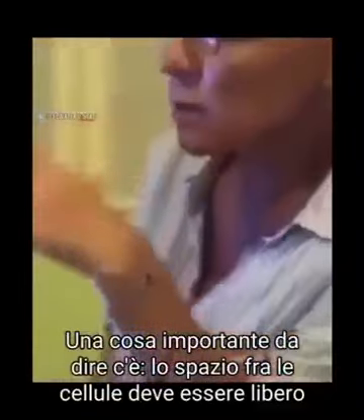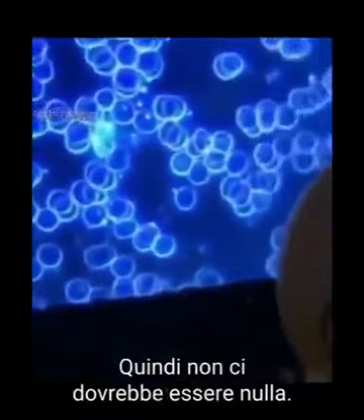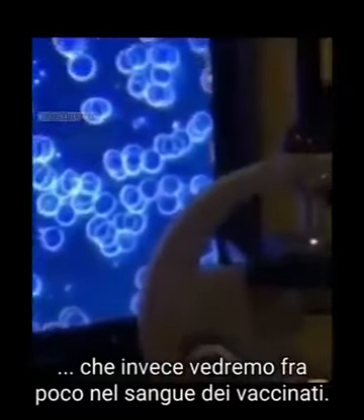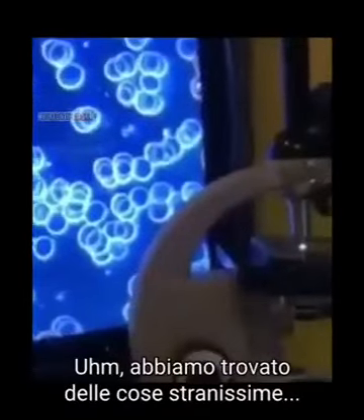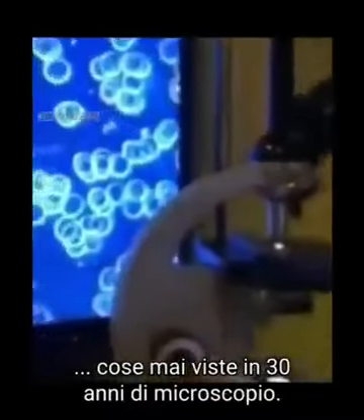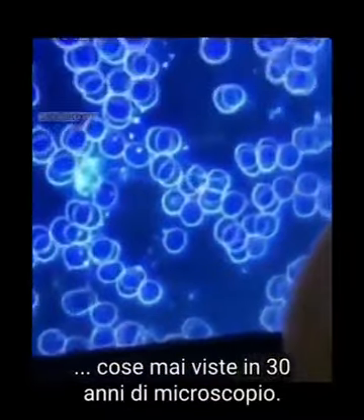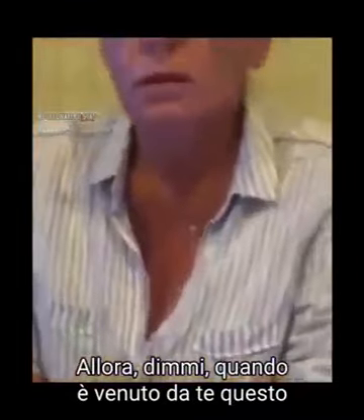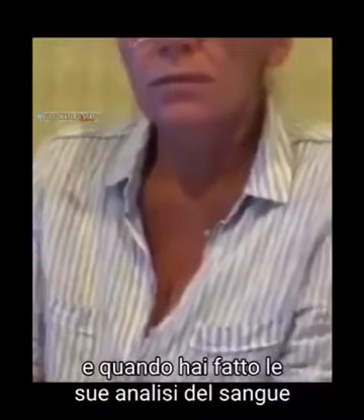So what is also important actually, is that the serum space is clean like here, so there shouldn't be any things like what you will see soon on the vaccinated people. So we found very strange stuff in his blood, which I haven't seen in 30 years during microscopy. So when did your patient come in? This client, when did he come in, and when did you test his blood, and what vaccine did he get?